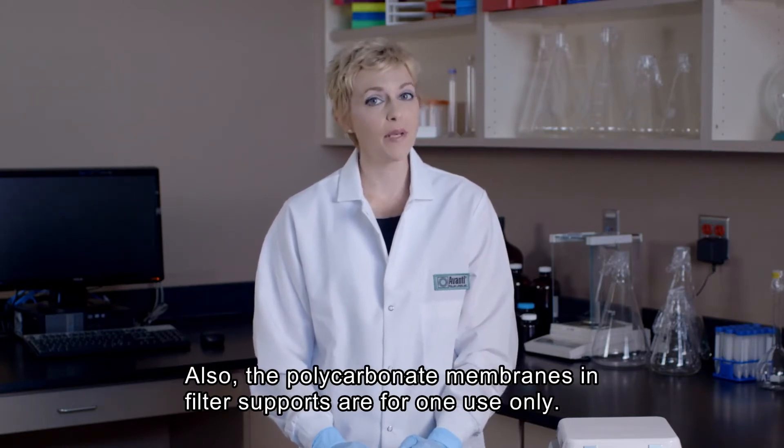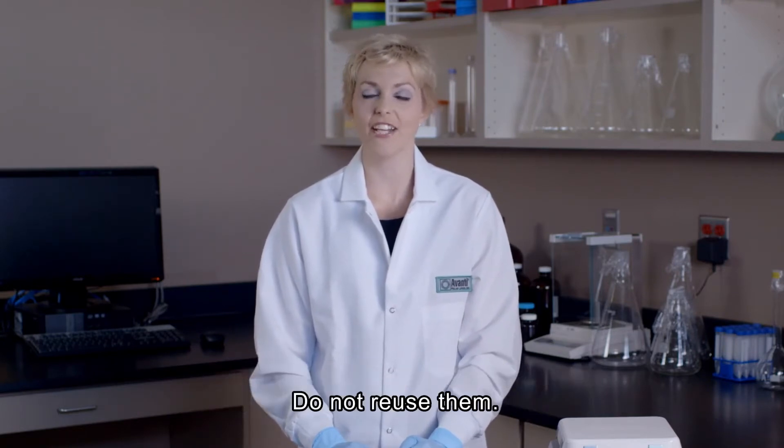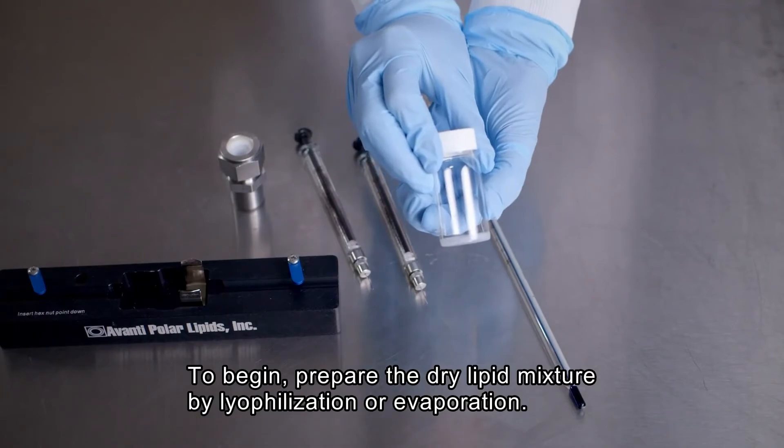Second, the polycarbonate membranes and filter supports are intended for single-use liposome preparation and should not be reused. To begin the extrusion process, we must first prepare our dry lipid mixture by lyophilization or evaporation.